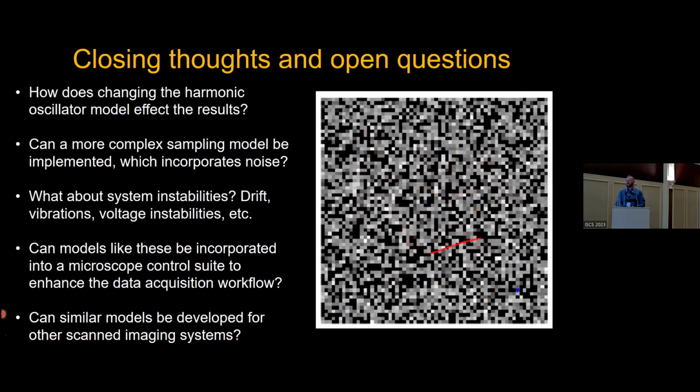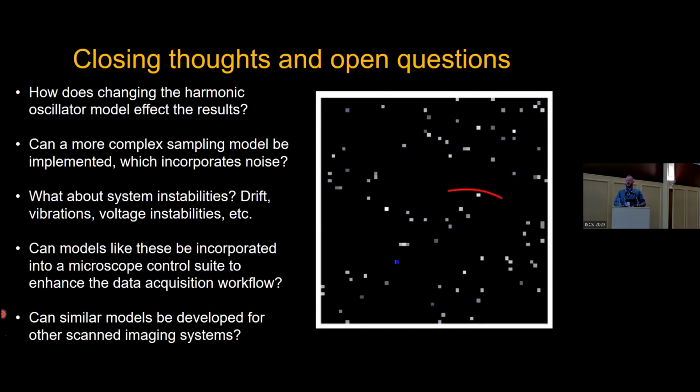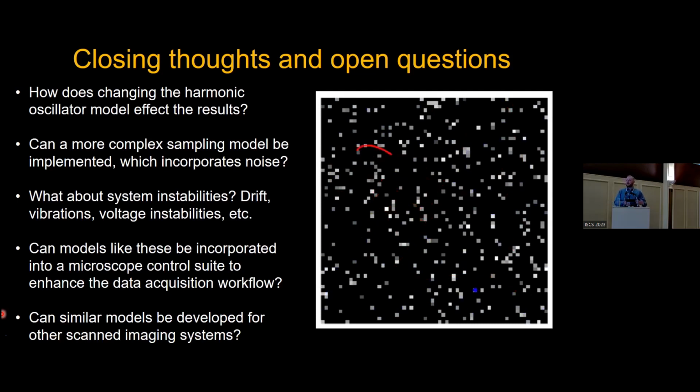Yeah, that's most likely the next step: getting something in the image simulator that looks realistic, finding the analog within the actual microscope, putting A to B to make sure all the parameters and scales are the same, and then seeing how well they match. Then we can iterate on the model and see if that lines up. Maybe it's completely wrong, maybe it's only a little bit far away, and then we can see. The next step from there is: if we know parameters about a microscope and we've got a decent model, how can we change things fundamentally within the model that could reflect actual changes on the microscope to make it more efficient?